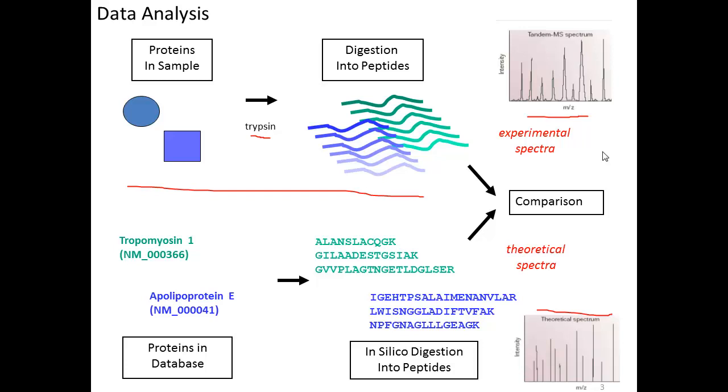On top of that, mass spectrometrists have put all sorts of heuristics into the correlation calculation, like, is it good enough? Are there enough amino acids in a row that match up? But the fundamental calculation here is a correlation between 200,000 theoretical spectra and each obtained experimental spectrum.